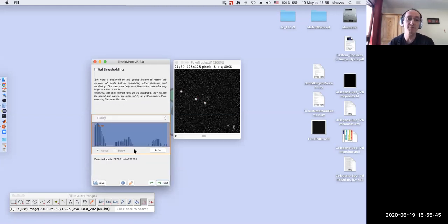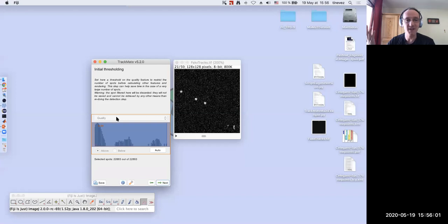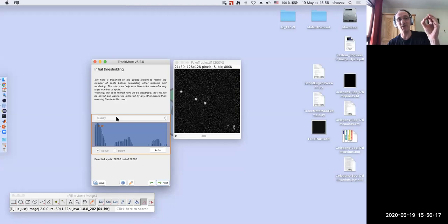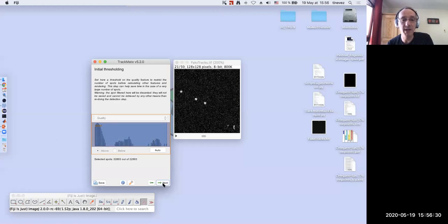If you want to get rid of spurious spots earlier, you can play with the threshold parameter. When happy with detection, click next and TrackMate executes the detection — it takes advantage of multi-core CPUs. After that, there's an initial thresholding step showing a histogram of all spots found — in this case 22,000. The quality metric reflects how likely a spot is to be a true detection. Quality is high if your spot is bright and of the right size. This step is optional.